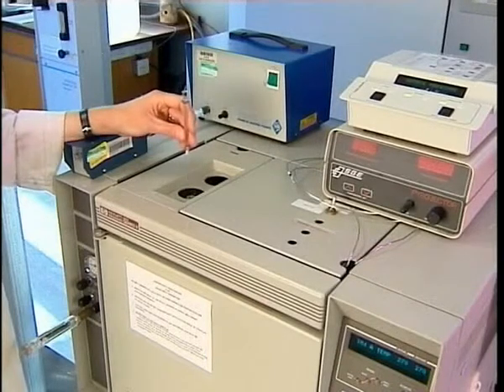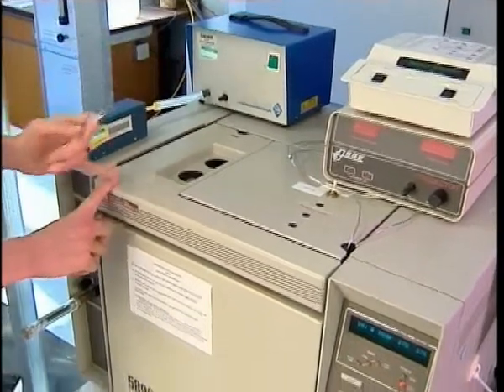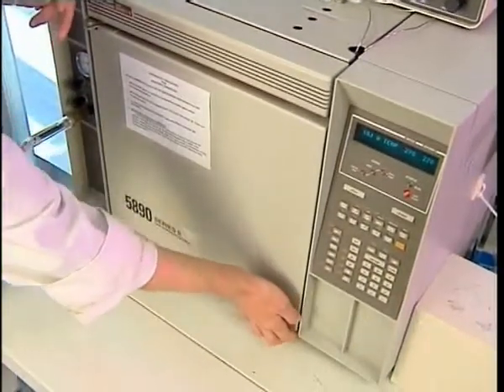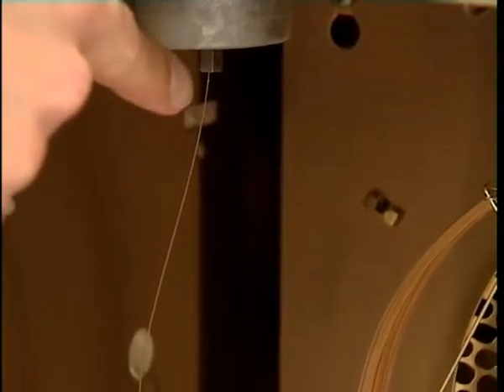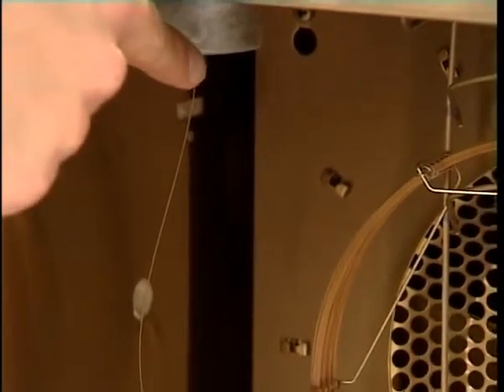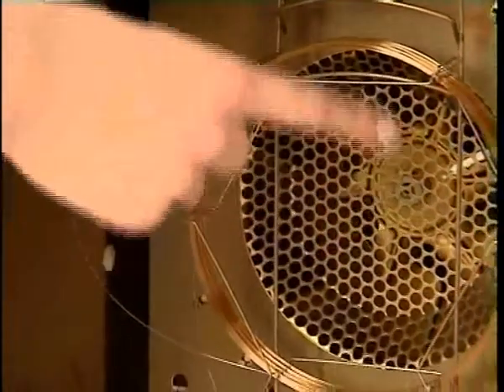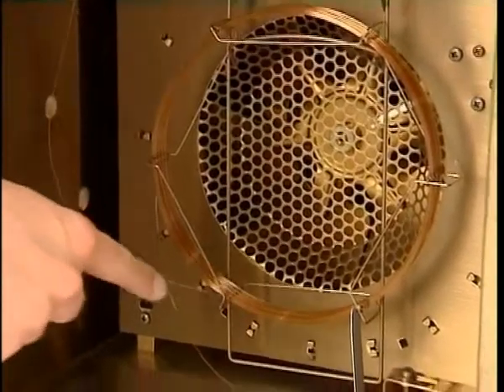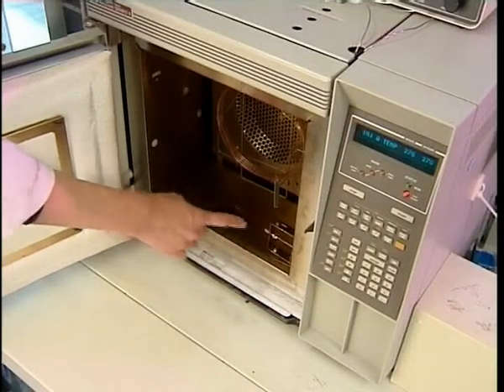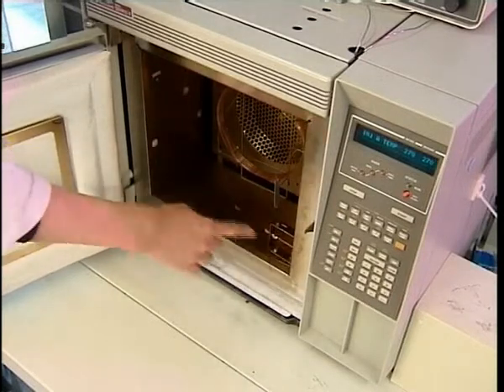Normally I'd inject a small part of my sample into the injector port of the gas chromatogram, but because I want to see what's going on inside, I won't do that now. The sample is injected and passes into the gas phase because it's in a hot injector port. The molecules are then carried through this very long, 30-metre, very fine column by a helium gas carrier. As the components are carried through, they pass out into a detector. The smaller, lighter molecules will tend to come out first, and then the heavier, more massive molecules will come out later on.